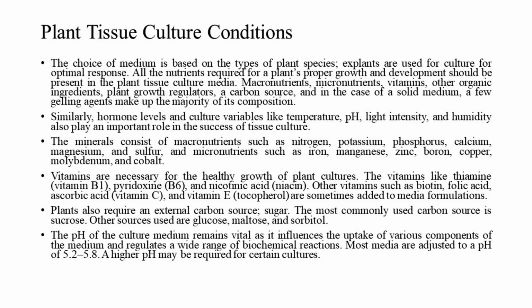The pH of the culture medium remains vital as it influences the uptake of various components of the medium and regulates a wide range of biochemical reactions. Most media are adjusted to a pH of 5.2 to 5.8. A higher pH may be required for certain cultures.